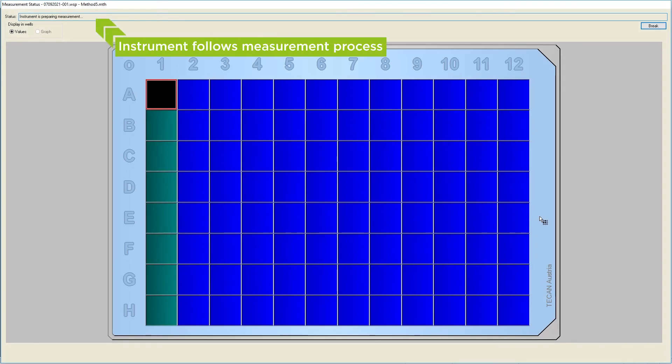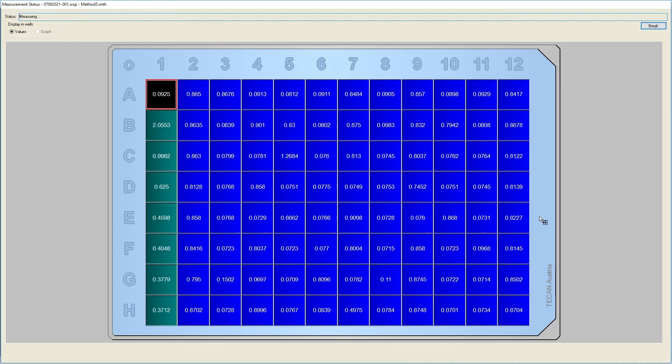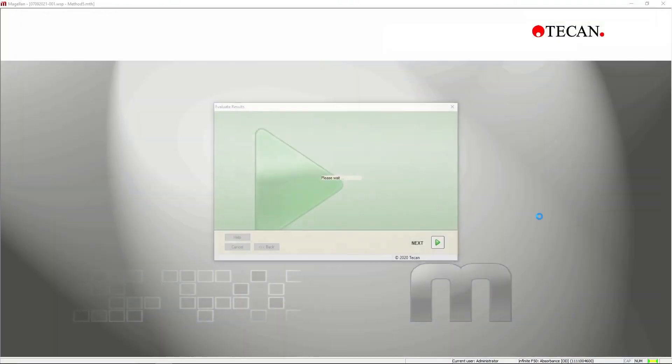Magellan creates a workspace file after each measurement, where you can view and analyse your data.